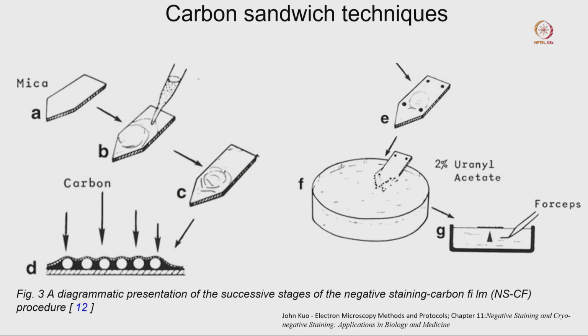There is a two way that I am going to discuss now. Previously, in 1980 or 1990, this method was used heavily. A lot of the time we were using glycerol or some kind of carbohydrate solution, so that our sample should not be flattened or collapsed. So, what do we have?